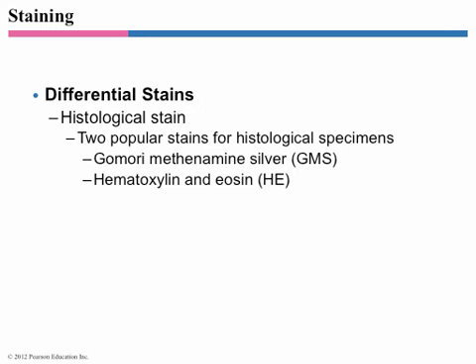It helps you differentiate. Most stains that we use in microbiology that are like tests are going to be differential. The Gram stain is differential. Endospore is differential. Acid-fast is differential. Capsule stain is not. We'll get to that in a second. But the vast majority of stains are, because usually what you want to know is, is it this or is it that?